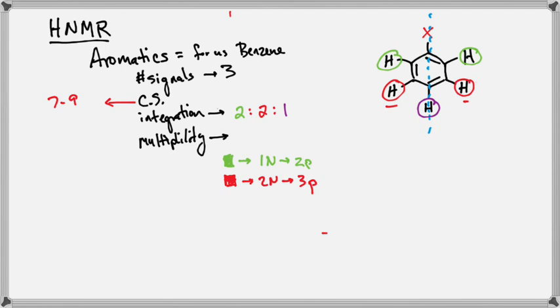So if we looked at it as each of those being one neighbor, our purple signal splits, right? Then our green signal splits it. But the green signal can't split it far enough away, which means these 2 peaks start to slide closer and closer to each other so that this middle part overlaps, which means 3 peaks. That's how we can get splitting of splitting and how it can reduce down into a normal splitting pattern that we would see.